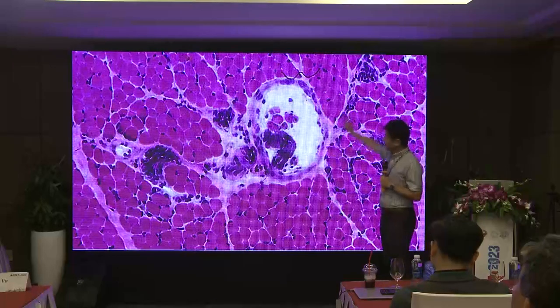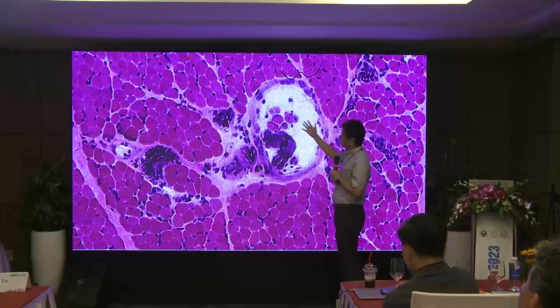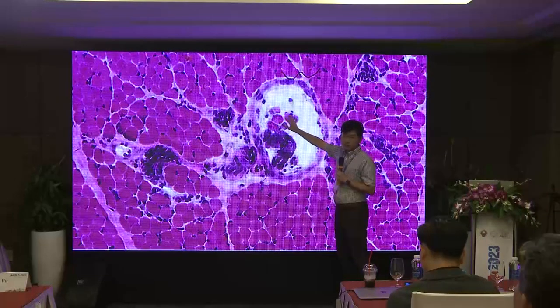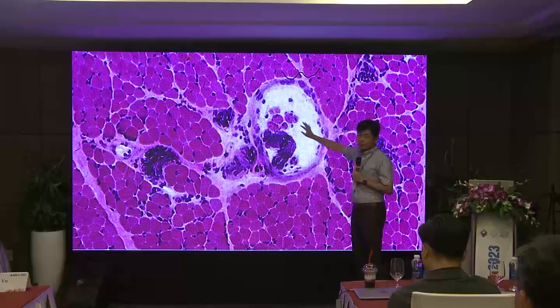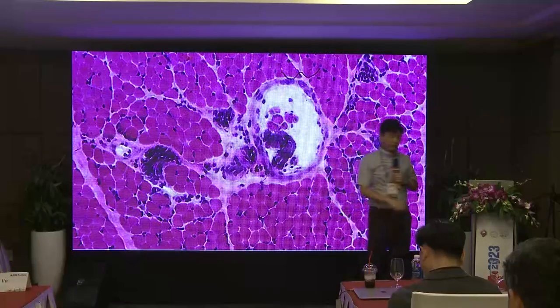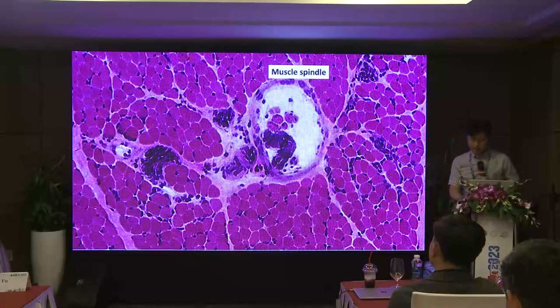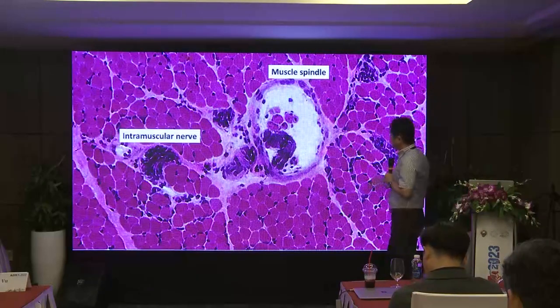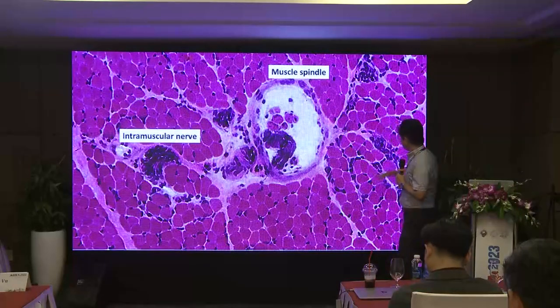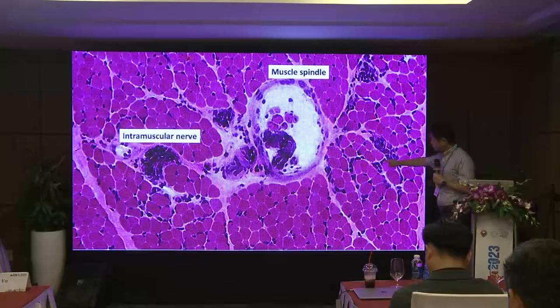If you look at the muscle sample, you may see other structures. This structure that looks like a vessel is actually not a vessel — it contains specialized myofibers called intrafusal fibers. This is a muscle spindle. Also present are intramuscular nerves, which are not always included in the biopsy but sometimes you see them. And this is a neuromuscular junction — meaning most likely this is a motor nerve. You sometimes do nerve biopsy of the sural nerve, but that is basically sensory. This intramuscular nerve is more like a motor nerve biopsy.